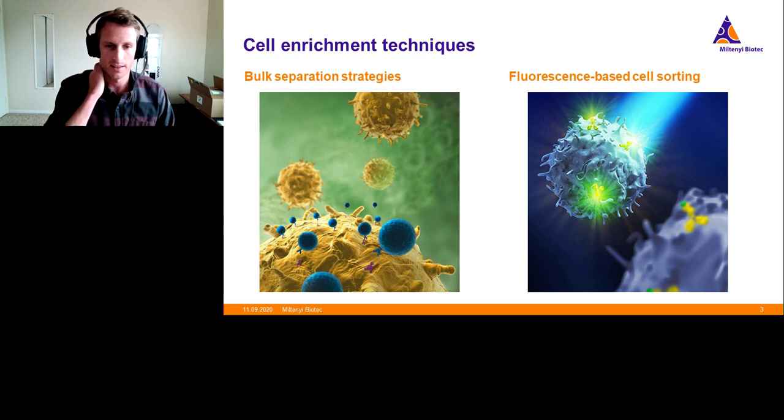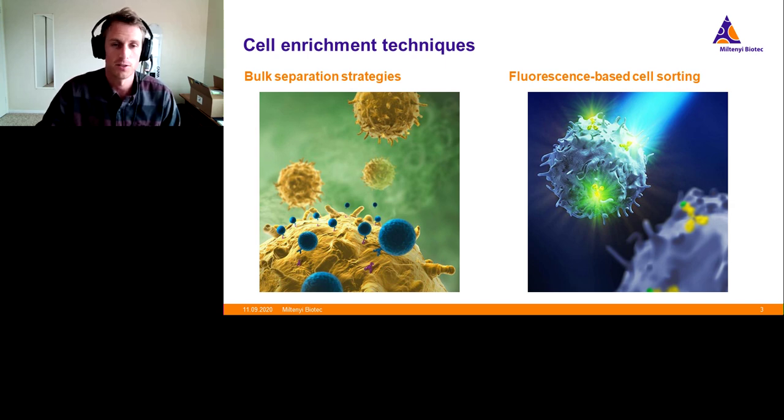In the interest of that, I'll start very, very broad on cell enrichment techniques. And I think anybody who's working in a cell biology field, immunology, you've done some sort of cell enrichment, and that can be as trivial as an antibiotic selection for an E. coli culture, or as specific as a 15-color panel looking for a very specific subset. There are drawbacks to each of these techniques, but we'll go into a little bit more detail.